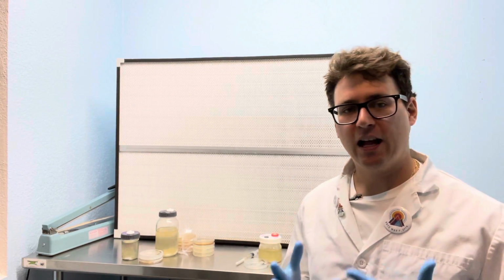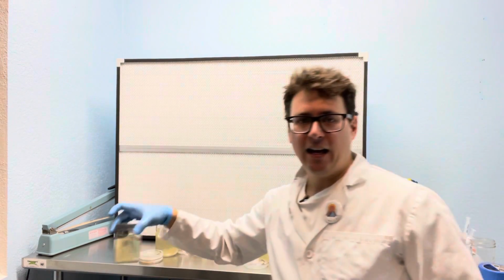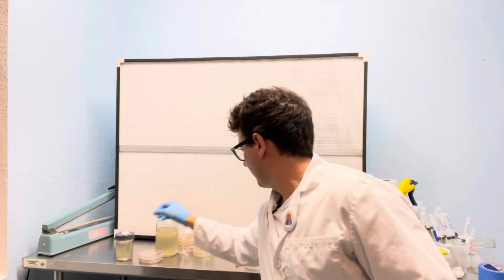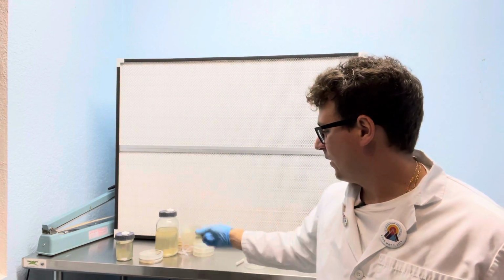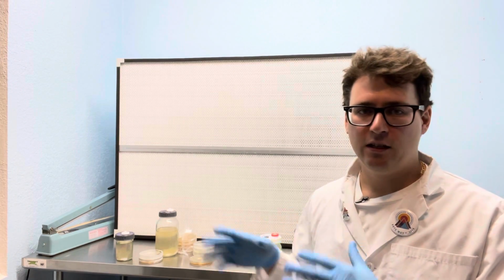I'm here in Denver, Colorado, and today I wanted to talk about the difference between LC, or liquid culture, and agar, or agar if you're from the Midwest. These are two different grow medias that are used to cultivate mushrooms. There's a little bit of difference in utility between a liquid culture and agar, and I wanted to bring up some of the differences.